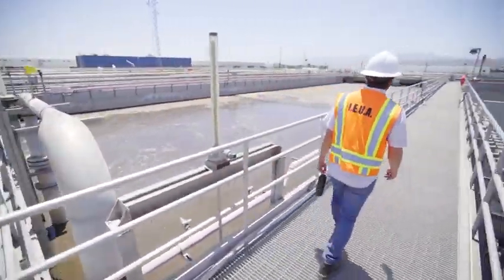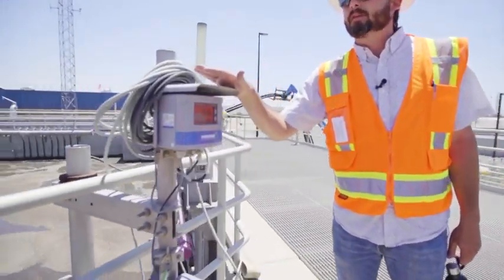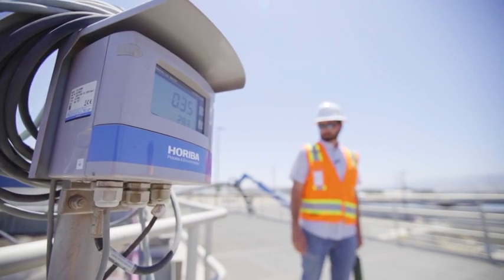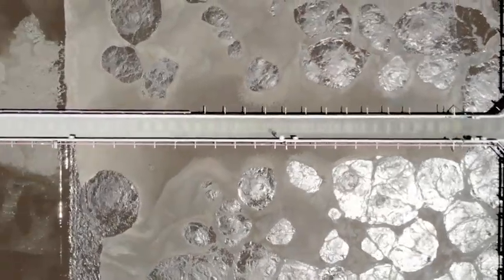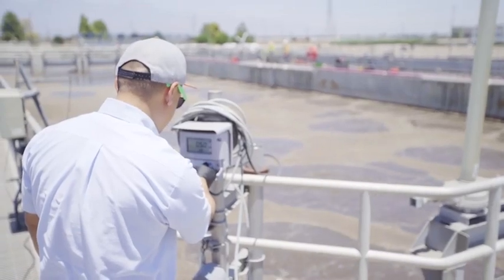So in order to predict the blower demand, we want to use ammonia probes to predict what an oxygen demand would be, in theory be able to ramp up the blowers when needed depending on ammonia demand rather than an arbitrary dissolved oxygen concentration in the aeration basin.